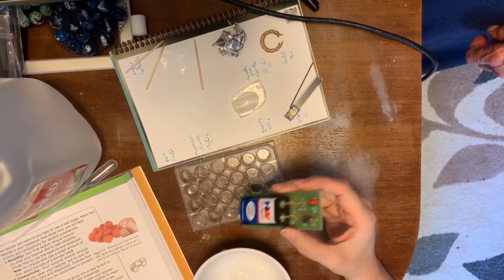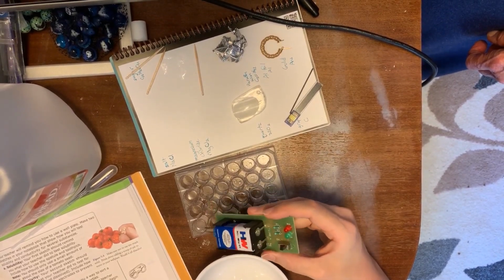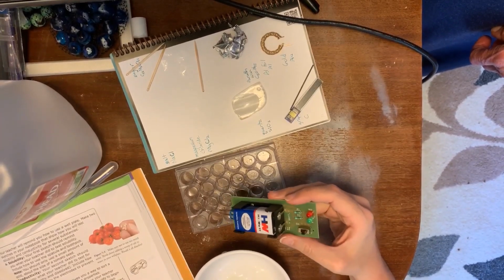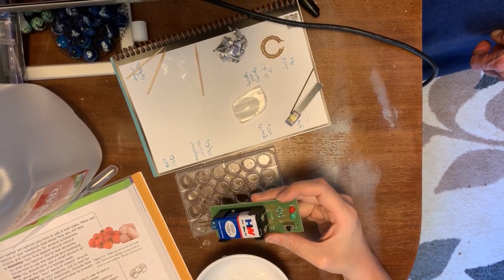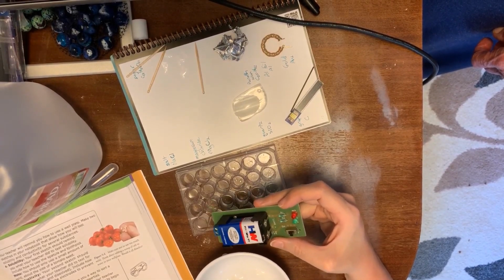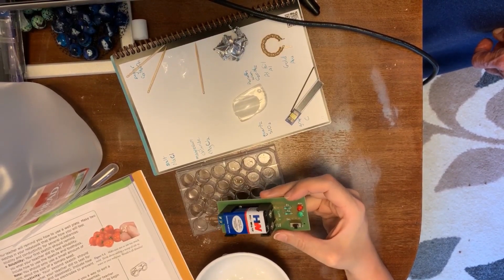All right. So now that we've tested the substances for whether they would conduct when they were dry, whether they would dissolve, and then whether they would conduct when they were dissolved, you can now fill out the table that's on page 165 in your book. We are not going to be showing the testing for hardness and melting point. Instead, you are going to see a table that gives you a description for each of those.